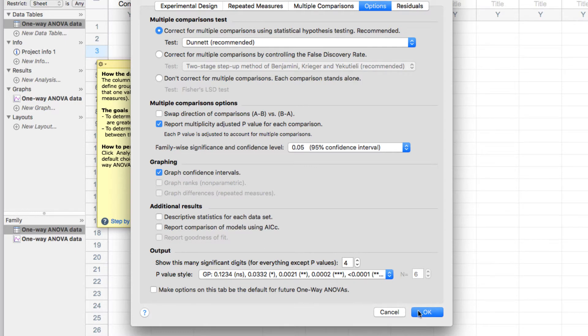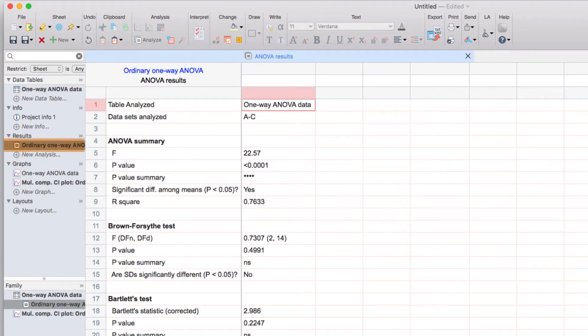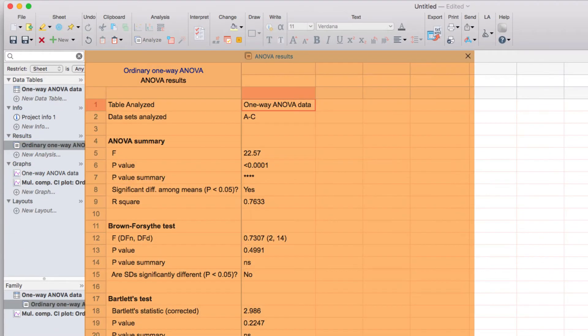you can see that there's only one result sheet, and that's for the main ANOVA test, and that's what's shown here by default.